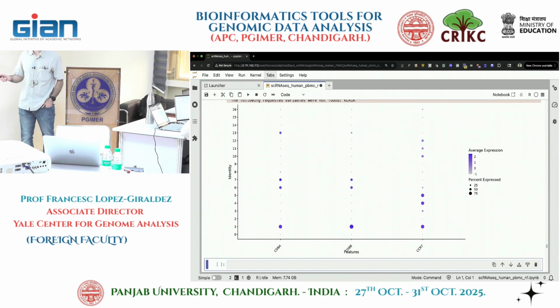Cluster 1 identifies these as key genes, right? Sorry, we cannot read it, but which one? And CCR7. So you can do plots also to test, right? It looks like cluster 1 are highly expressed. Could it be that there's another cluster having all three? There's only cluster 1 that has all three being highly expressed. So maybe they are T cells? CD8?